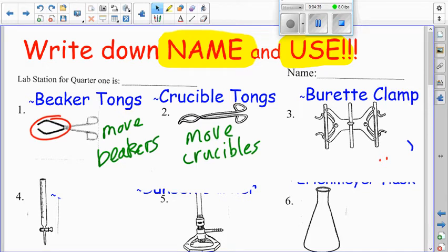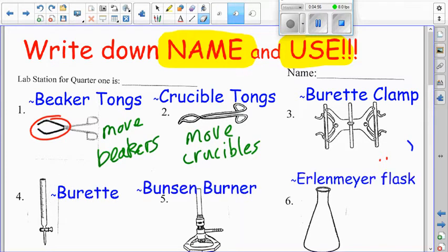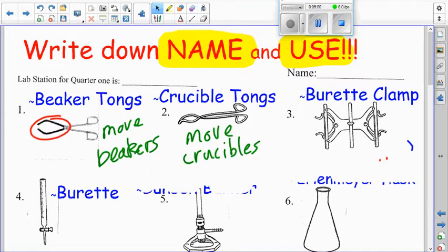Here is a burette clamp. I'm going to go ahead and flip this around for a second. This is a burette clamp, what I'm putting my left hand on right now, okay? A burette clamp holds burettes, which is what number four is, and which is what is being held right now. That is a burette, and a burette clamp holds that.